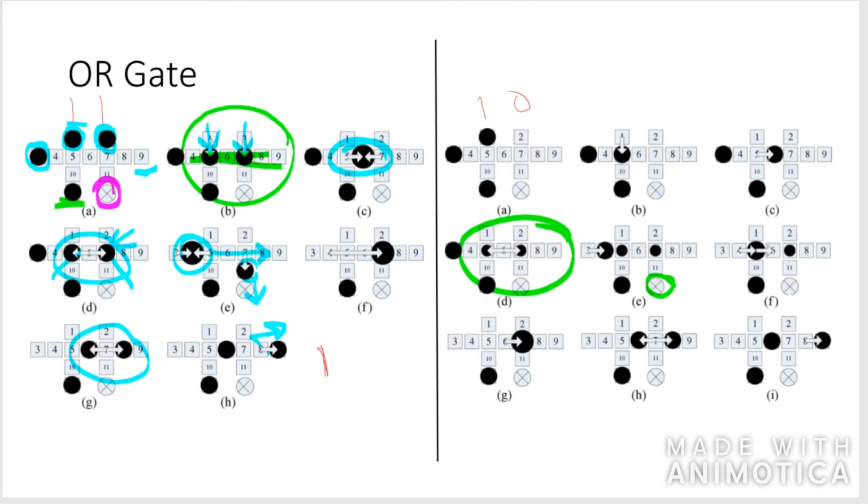Similar to the previous example, a reference droplet is diverted through the channel. This time it combines with both 0.5x droplets, and you see it's diverted down, and that yields a droplet of 2x in its volume. That droplet is split, and the output again is 1. So this is an OR gate.